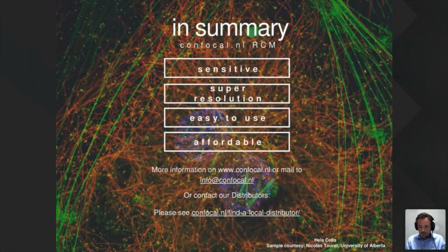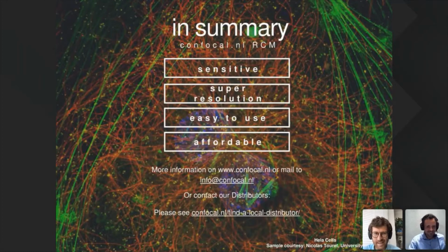I guess there will be some questions. So Vincent, could you go ahead and answer already some of them? Then I'll make sure that the system is working. Yes, I'll be happy to take over here for a few minutes. Will, about your question, actually, I think I need help from you, so we're gonna check that after. Oh, you can do it now.